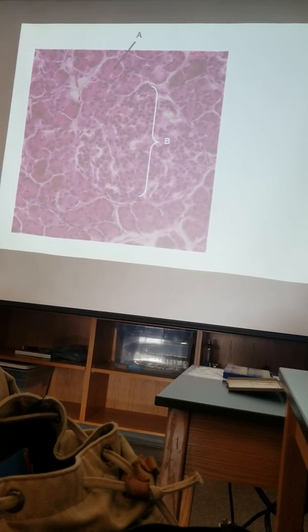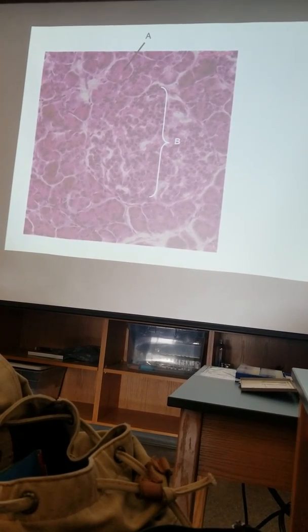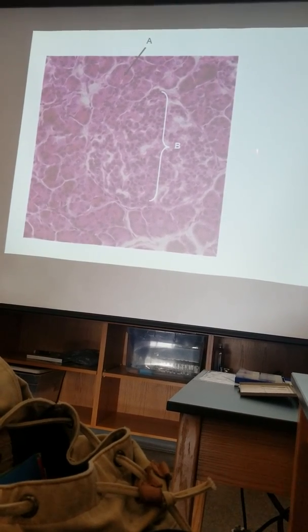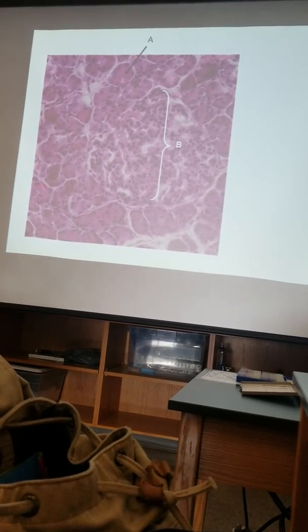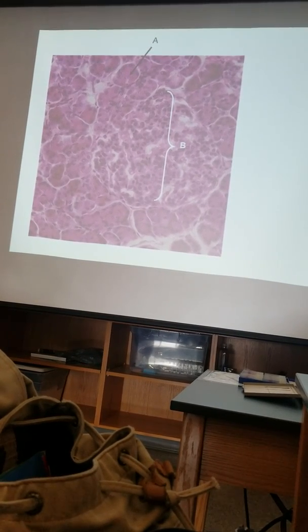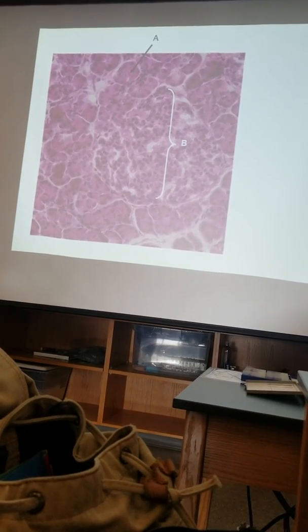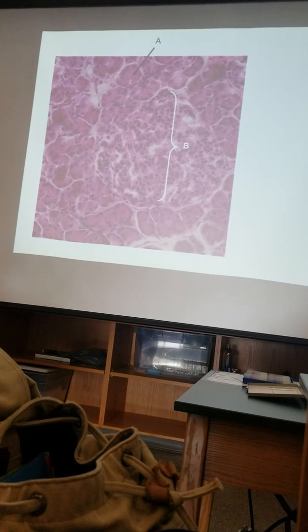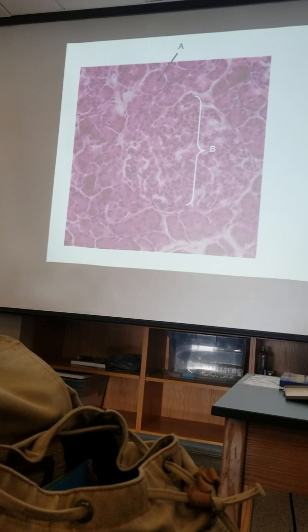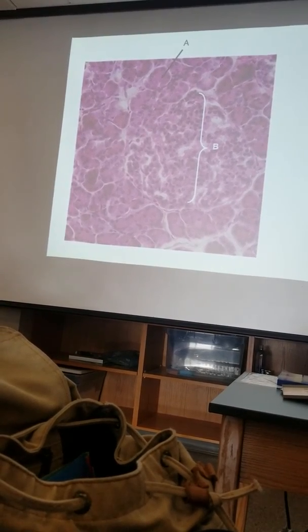All right, now this one might have been fairer to give you a low mag image alongside. Part of it is that the bulb is getting dim, but we have 2 different kinds of tissue here. So it should let you know that this is what organ? It's pancreas, yeah. And so the structure at A is an acinus. So we're looking for acinus or serous acinus, pancreatic acinus. Would all be good.